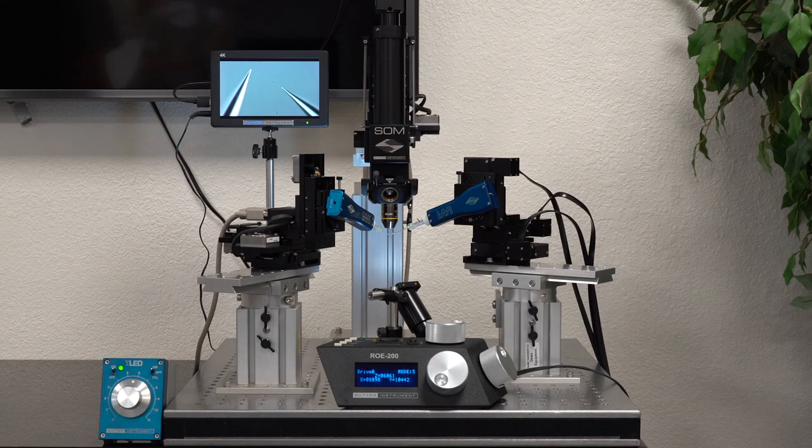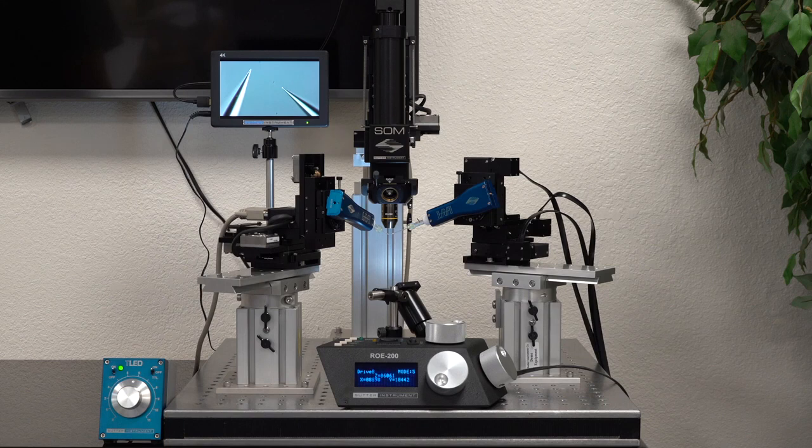If the primary purpose of the rig is in vitro experiments, we would suggest you use one of our other microscopes such as the BOB and NAN.